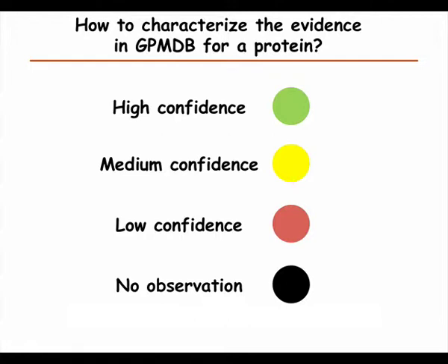If we do the regular statistical filtering, we can either filter too much, because we have so much multiple testing that almost nothing will be significant, or we can run into the other problem that we let through too many false positives, and it looks like we have evidence for all the proteins in the database.